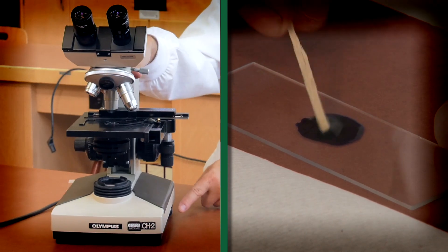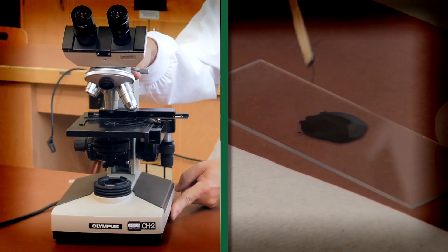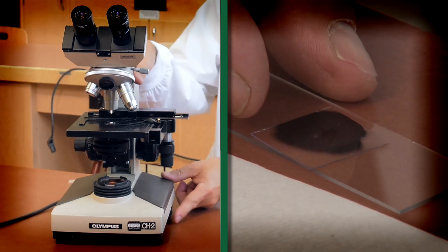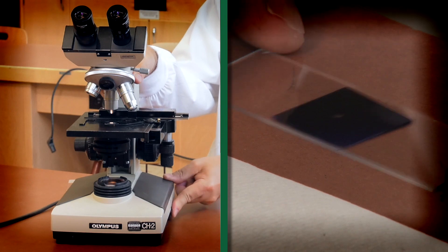Do you need help setting up your microscope or making a wet mount slide? View our instructional videos on the compound microscope setup and making a wet mount slide, or ask a TA for help during your lab.